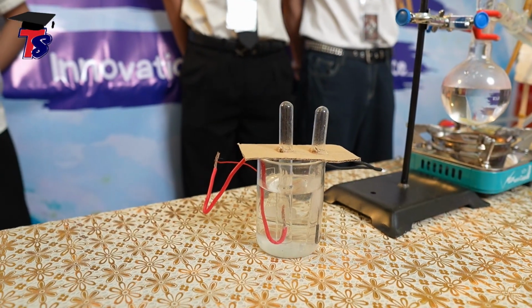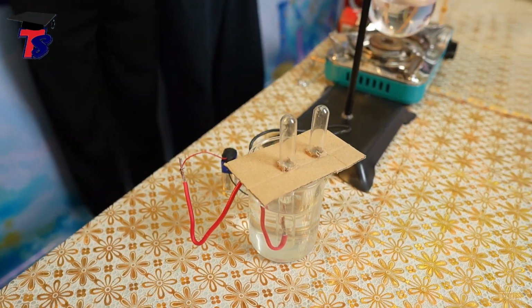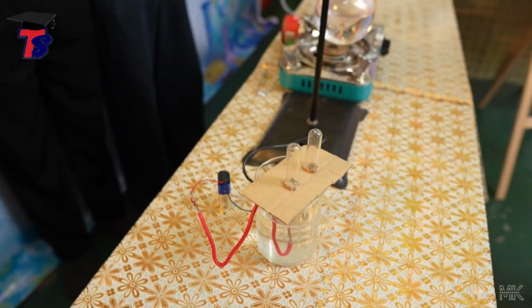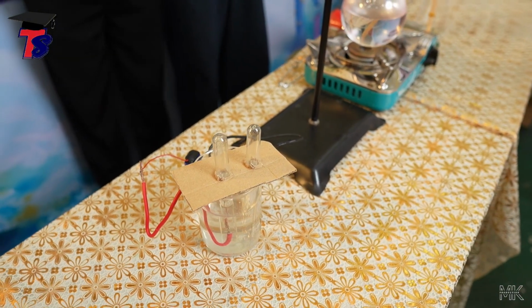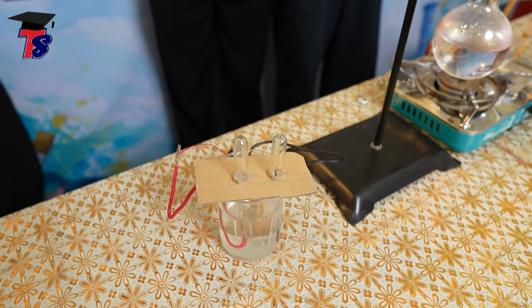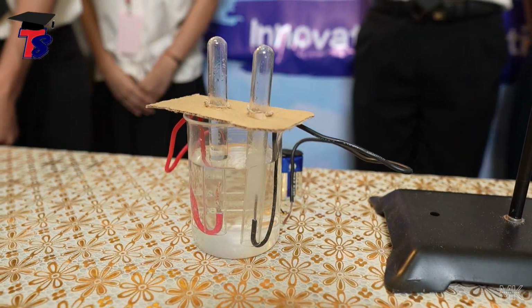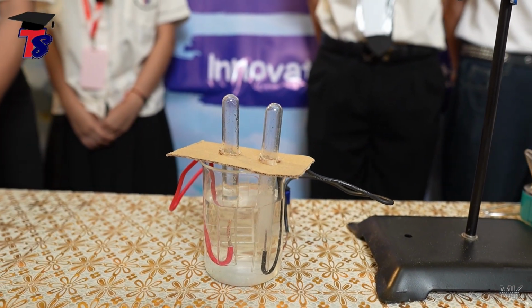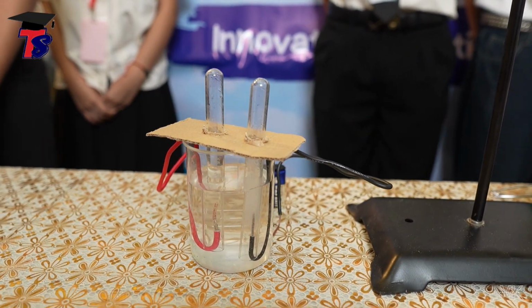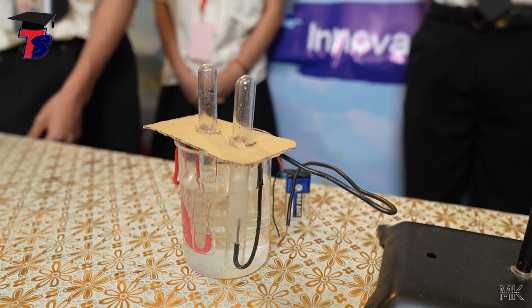As you can see, this is electrolysis. The beaker contains sodium chloride solution, and it's connected to wires with a 9-volt battery. At the black wire, you can see that there are a lot of bubbles, meaning that this is the cathode, and hydrogen gas is being produced. While at the anode, less gas is being produced. This is due to it being chlorine gas.